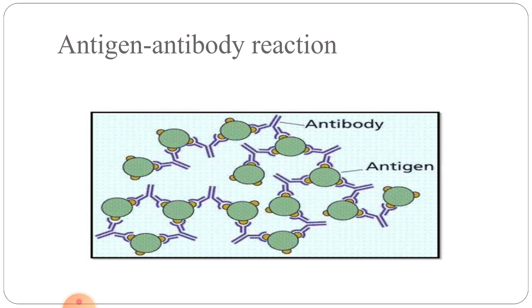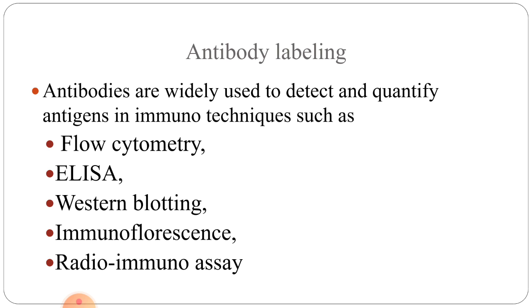Antigen and antibody are specific to each other when they come across each other, and they form a complex known as the antigen antibody complex, or this particular lattice is known as the antigen antibody reaction.